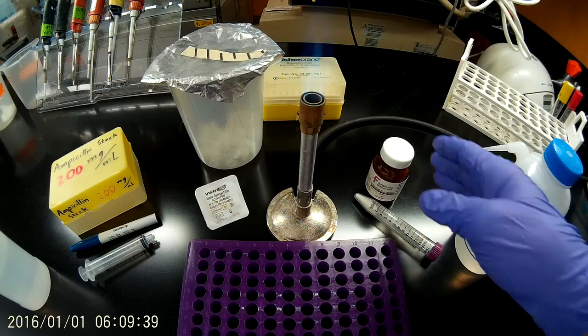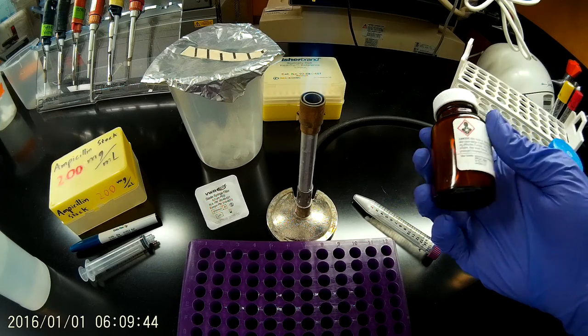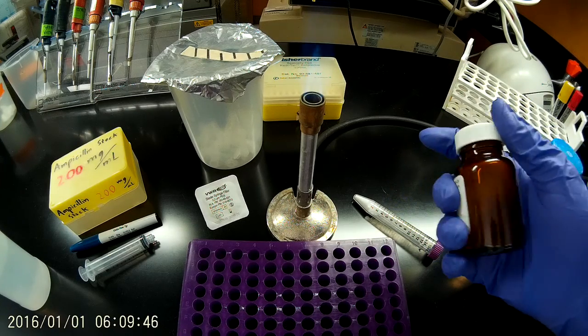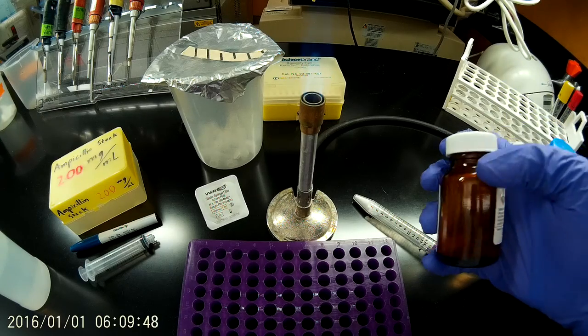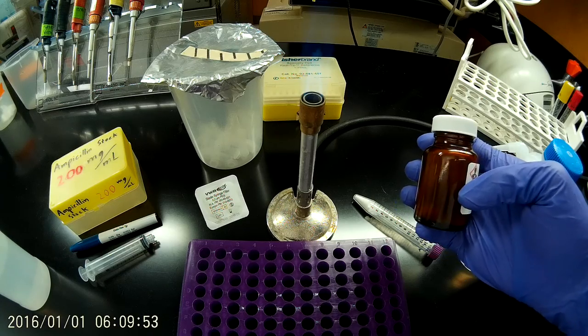To start, first we're going to remove our ampicillin from the refrigerator. It's stored at between 2 and 8 degrees Celsius. When you remove something from the refrigerator before opening, make sure that you allow it to warm to room temperature so that water doesn't condense into the powder and cause it to degrade faster when you put it back in storage.